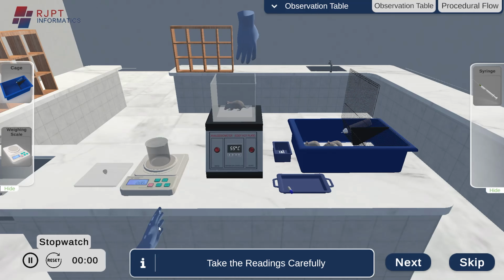We will start the stopwatch again and record it. As we can see, the timer moves, and a much greater increase in the timer has been observed. The reaction time of the mouse has increased. For the second mouse also, we will perform similarly.